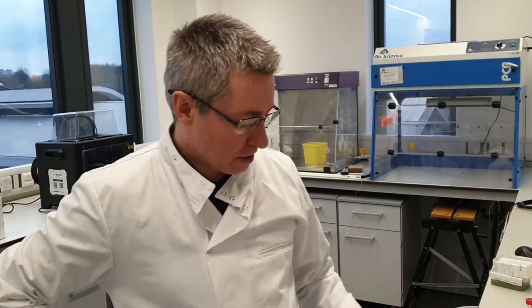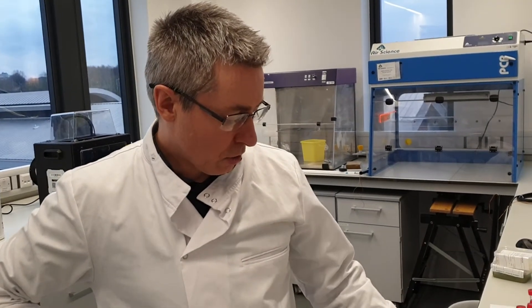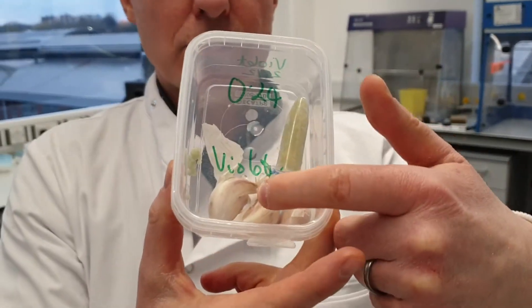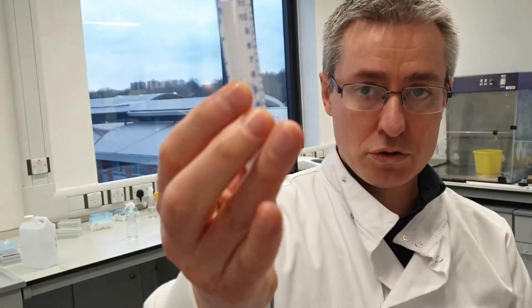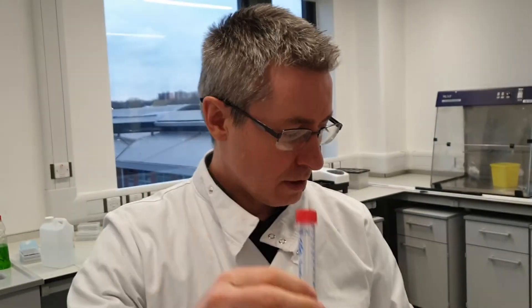This afternoon we're going to test some violet garlic. We have some cloves chopped up in here. We've taken half a gram of violet garlic and put it in two mils of buffer, so there's basically an extraction prepared.